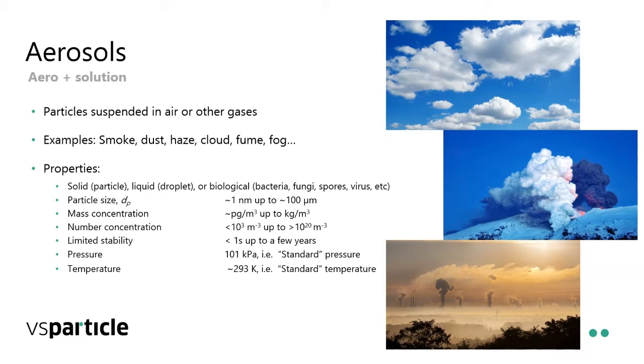Something to keep in mind with aerosols is that they have very limited stability. Most aerosols are continuously evolving, continuously changing, and slowly they will decay until they become a more stable thing over the course of years. But where you're practically working with them, they are always changing. Luckily for us, we can focus just on room temperature and room pressure. So at least some things are somewhat stable.